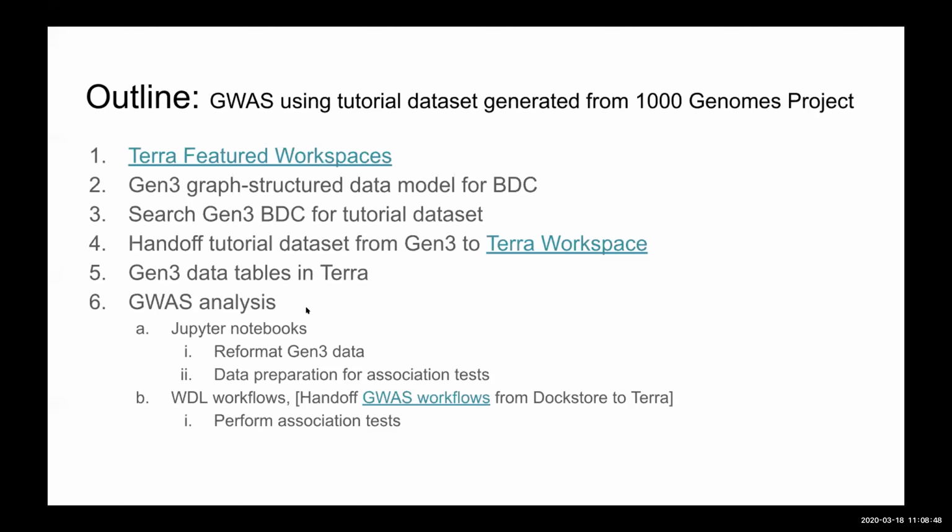And what I also just want to say is that this new ecosystem brings differences to how the researcher interacts with the data. So it's like a new data model. And I think the goal of this tutorial that my team is making is trying to get a researcher used to using this ecosystem and this data model, as well as learning how to do an association test. But I think going through this can help a researcher be able to use a lot of the other featured content that is on Terra that they might feel a little bit more hesitant about how it actually works when you're bringing in the BioData Catalyst or AnVIL system to this content that's already available and has been used in different ways.